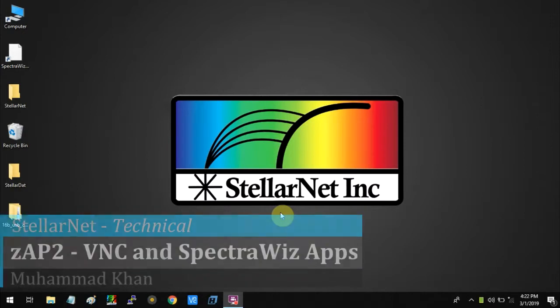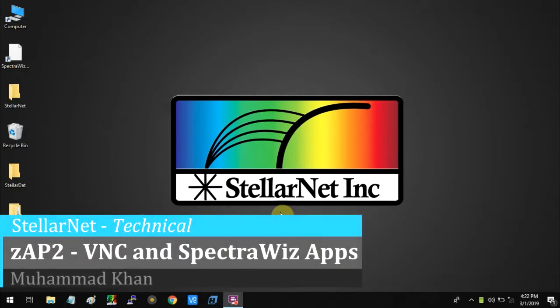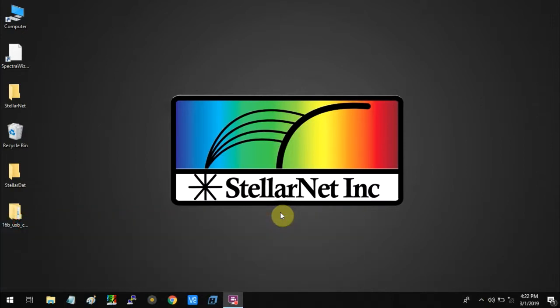Hello everyone. Today I'm going to show you how to connect the ZAP2 and Smart Control to the VNC Viewer to access the SpectraWiz mobile app.